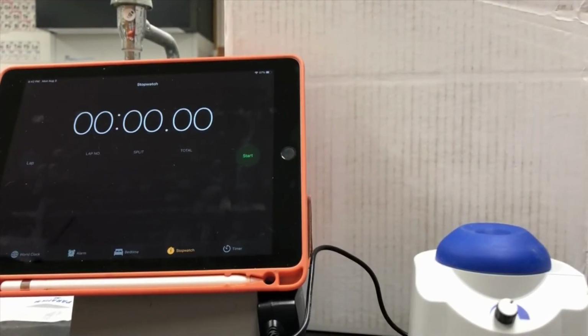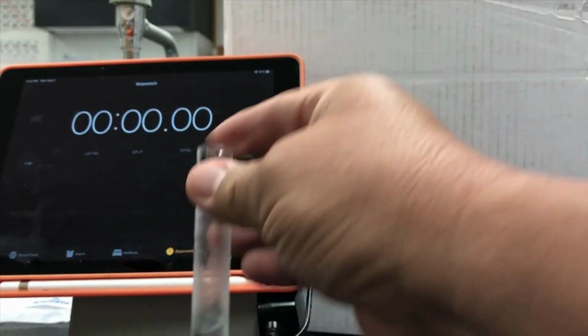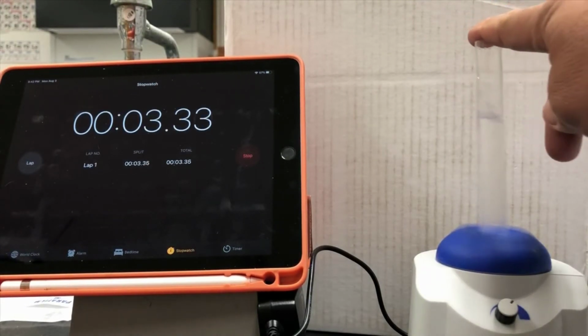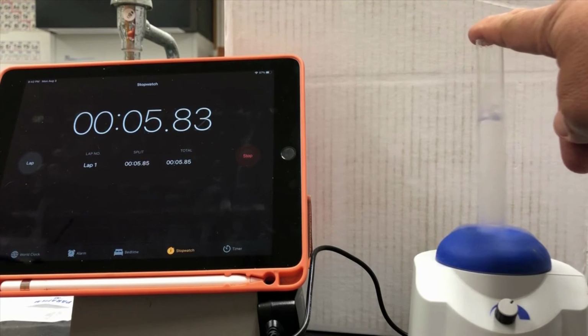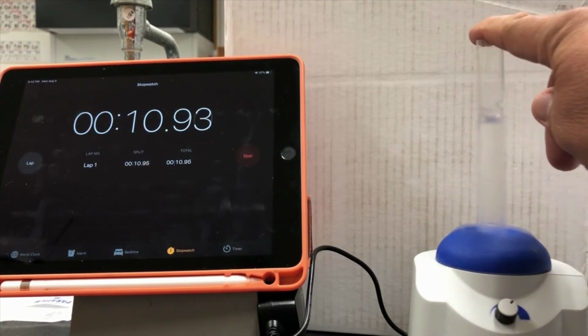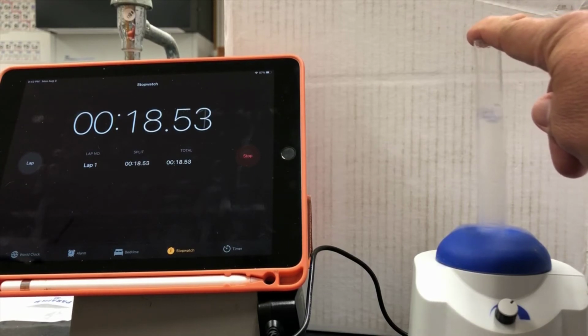At the end, just like we did in our previous trial, we'll go ahead and record the temperature in the larger tube. It may be a little harder to see, so we have to look very closely. It's cold enough that it's frosting over a little or clouding over on the outside.